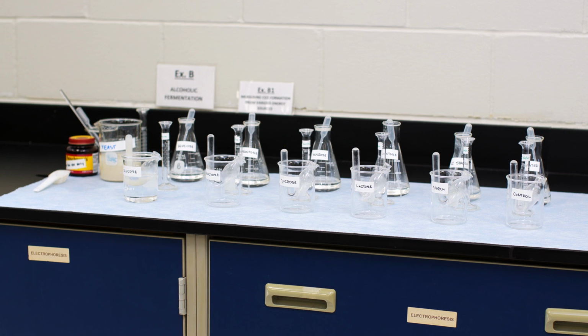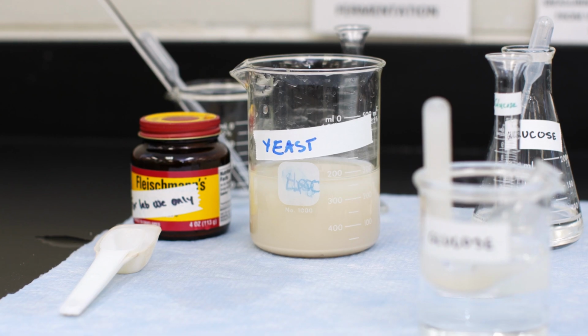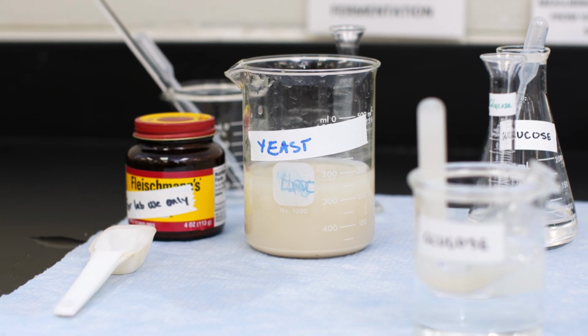Okay, so in this experiment B, we're going to investigate a little bit about an anaerobic form of cellular respiration that we've learned about called fermentation. And in this experiment, we're going to use some yeast cells and investigate whether they can indeed do some fermentation, and also give them different choices of energy-rich organic molecules to potentially try to use to do their fermentation with.